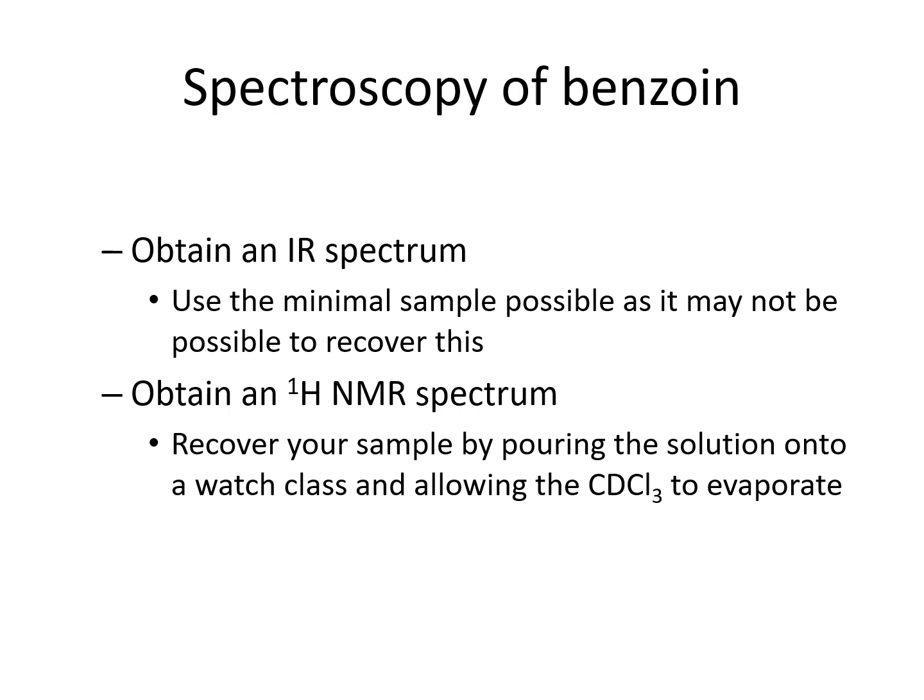So as usual, because we're working with organic compounds, we'll be doing spectroscopic experiments to be sure that we have synthesized the compounds we are trying to synthesize, and we'll be using IR and NMR as usual.